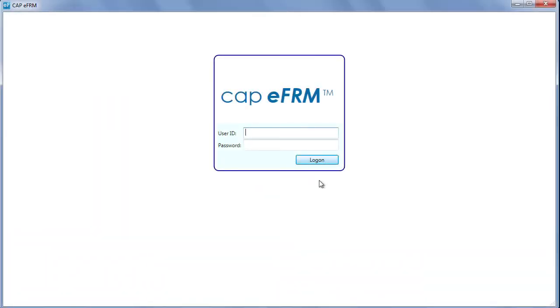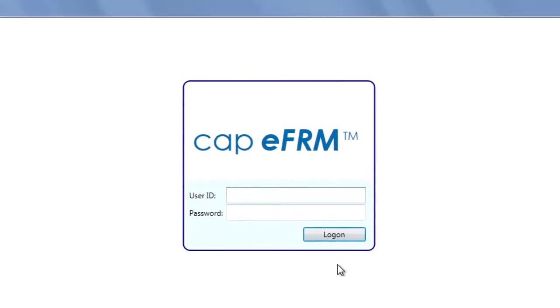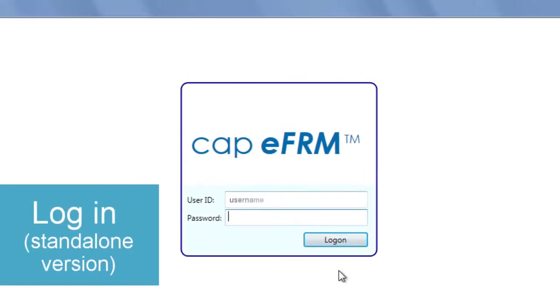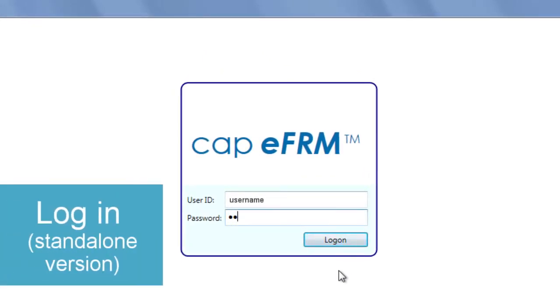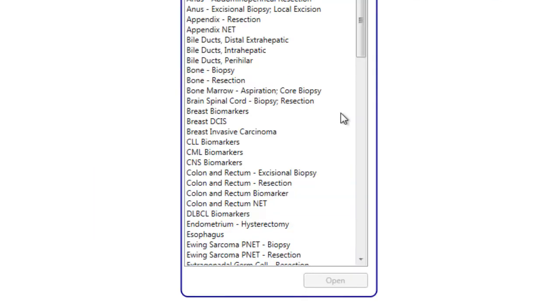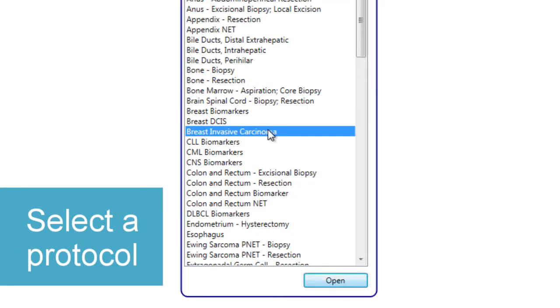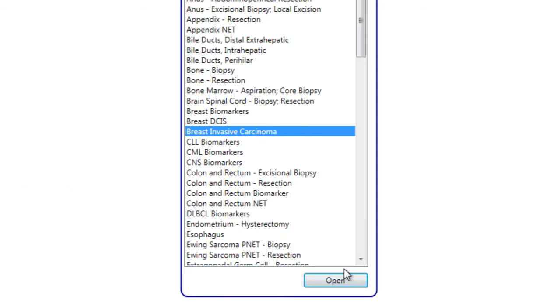Let's take a look at just how easy to use E-Form is. If you're using the stand-alone version, first sign in with your user ID and password. E-Form provides real-time access to the latest CAP-developed cancer protocols.